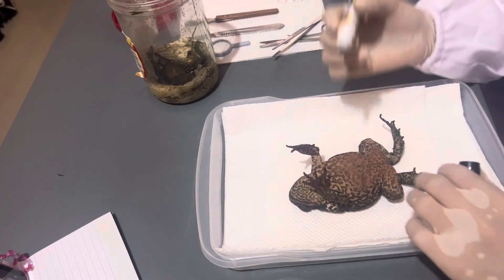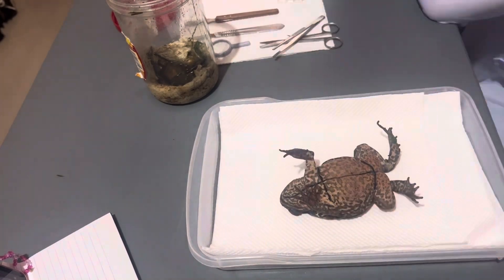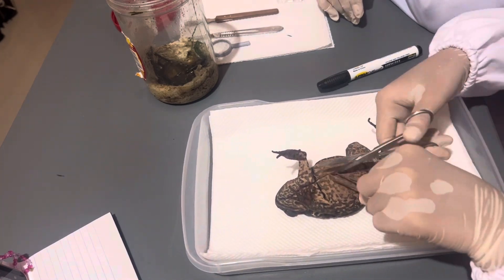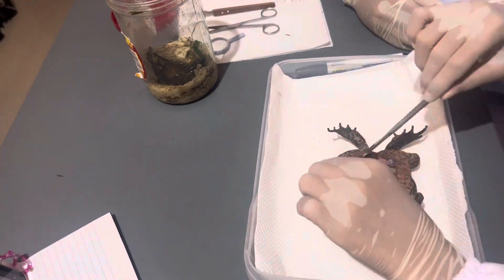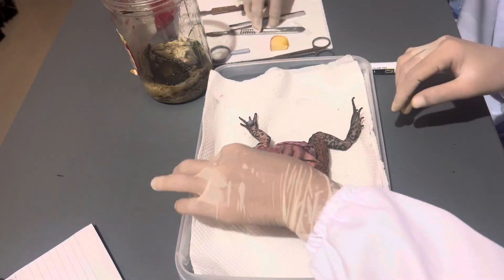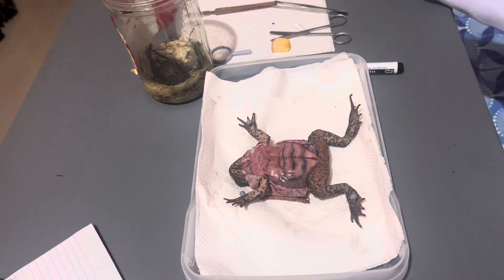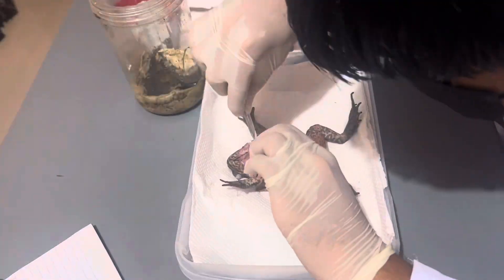Before dissecting the toad, I am going to draw the incision guides on its skin. Now using the forceps, I am lifting the skin on the bottom part of its body in order to make it easier to cut through. After the skin is cut, we can see the muscles of the toad. We then pin the toad's front feet and back feet so that we would not have difficulties in cutting the muscles.